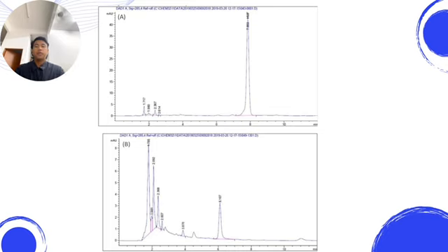The chromatographic result for the 4 honey samples, which are samples 1, 9, 10, and 14, failed to detect any amount of HMF as shown in table 2 and graph B. In the remaining honey samples, the HMF levels were found to be well below the maximum permissible limit, indicating the freshness of the honey samples as well as suggesting that these honey samples were not heated.